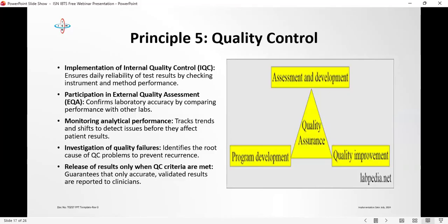Investigation of failures must be done, and you need to get to the root cause. Ask the question, why did this thing fail? Did I load a new reagent? Why is this person behaving in this manner? This is greater than 2SD, this staff behavior. You need to get to the root cause and solve the problem. And did you document it? It is not that you did a root cause. You need to also document and have a review meeting on these root causes that happen.